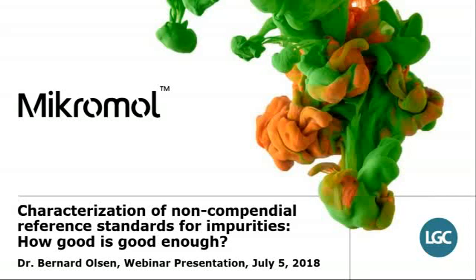Okay, thank you very much, Christian, for that introduction. I've worked with impurities pretty much my entire career, so it's a pleasure to be here today to talk about characterization of reference standards. Just a couple of scope statements to start with. Just to emphasize, we're talking about non-compendial reference standards for impurities today, and the scope will be synthetic organic compounds as opposed to biologicals. Also, just to be clear, I don't represent USP or any USP policies or procedures in my talk today.